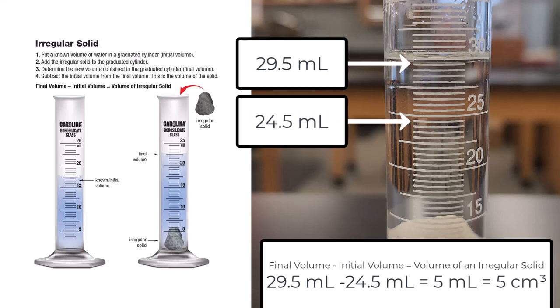Subtract the initial volume from the final volume. This provides the volume of the irregular object. In this case, it is 5 mL or 5 cm³.